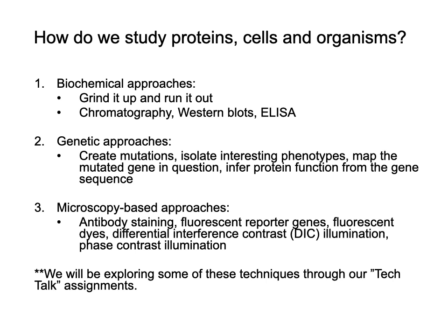And then in ELISA, you're using a dish with multiple wells where we've added antibodies that are specific to certain proteins, and that allows us to detect whether that protein is present or not. So as I mentioned, chromatography we're going to look at more in this tech talk. I'm planning on talking about ELISAs for tech talk 2.